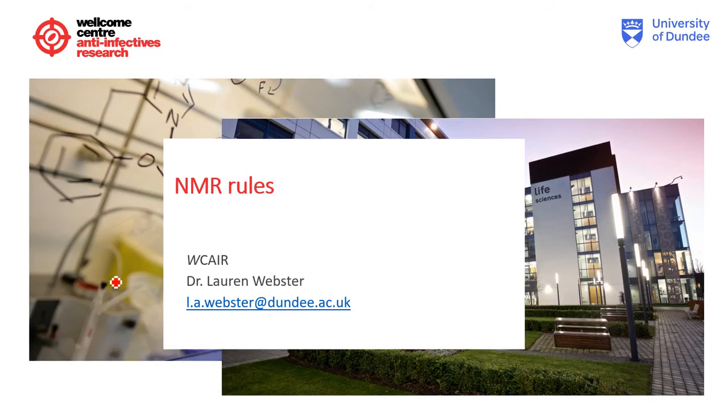So today I'm going to go through the NMR rules. These are rules that are probably not going to be written down specifically in any textbooks or websites, but these are a compilation of looking through those websites and textbooks, etc. And this is a means for anybody to be able to understand how to interpret at least a 1D spectra. So these rules are just more like guidelines. They can be elaborated on further, but here I've picked out the key points.